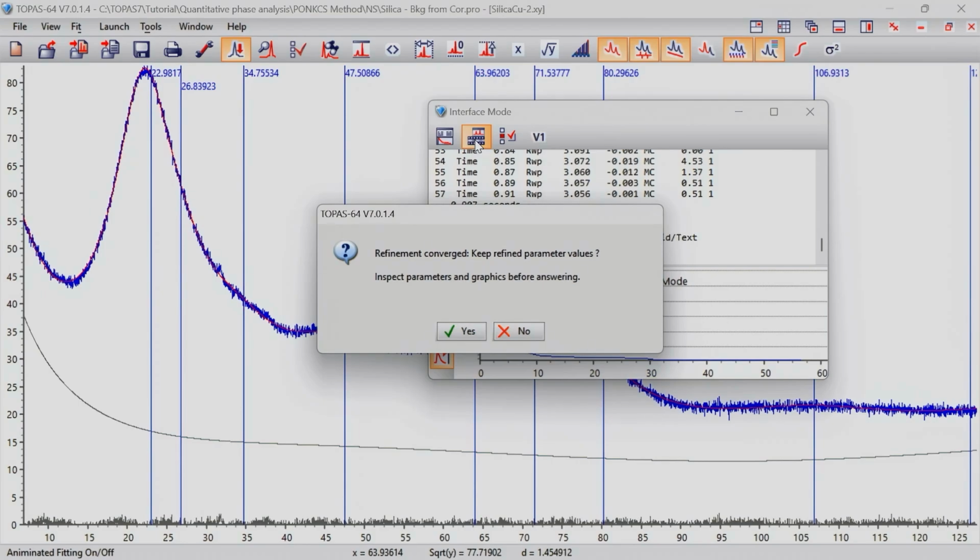Yeah, please. If you use a silica powder, this reduces the dimensionality of your problem to obtain the signal. So it is the shorter range, the very short range. You can use the symmetry of your silica. You put the constraint at a very short distance. You can put 10 Angstrom and you obtain the right symmetry. Yeah, you can do that.